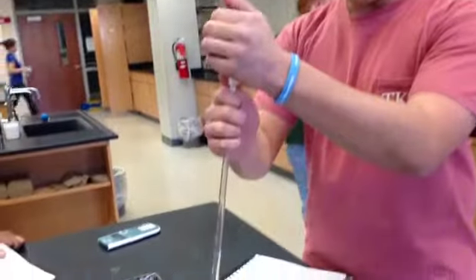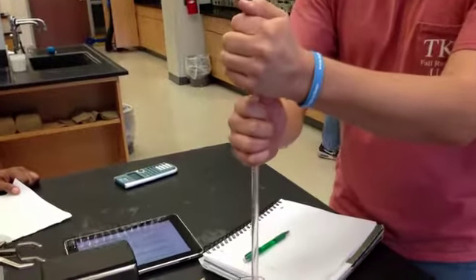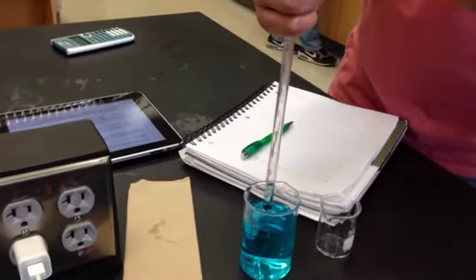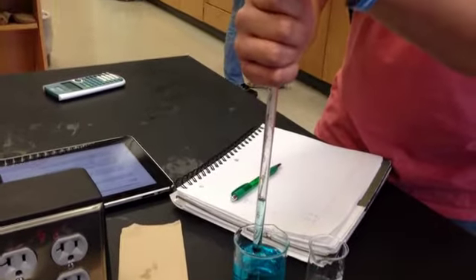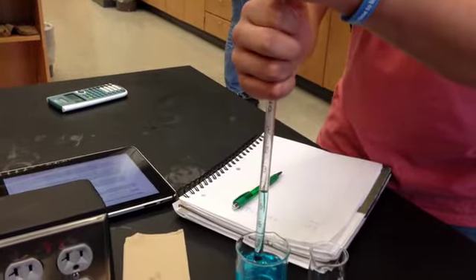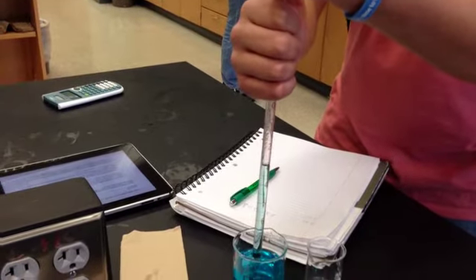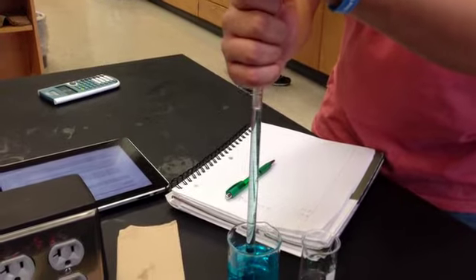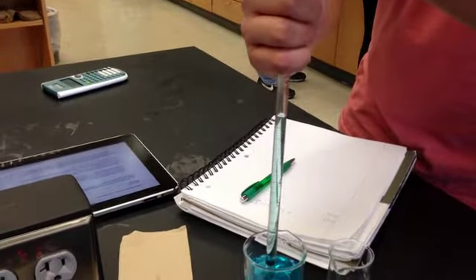You're going to squeeze it, stick it in your solution, slowly release it, because if you release it too fast, the solution may shoot up into the bulb, and you don't want that, because then if you're dealing with acids or something, then it could get really nasty if you're trying to clean it. So you're going to let it go up, and then put your thumb on it to stop it, okay?